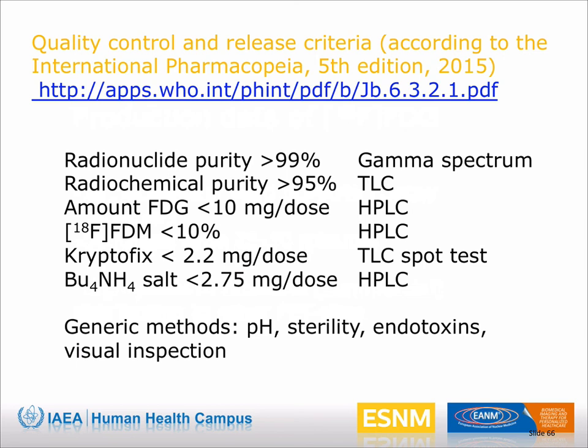The maximum allowable cold FDG present in the patient dose should not exceed 10 mg. In addition, there are requirements for the presence of phase transfer catalyst in the final product, as both are toxic.